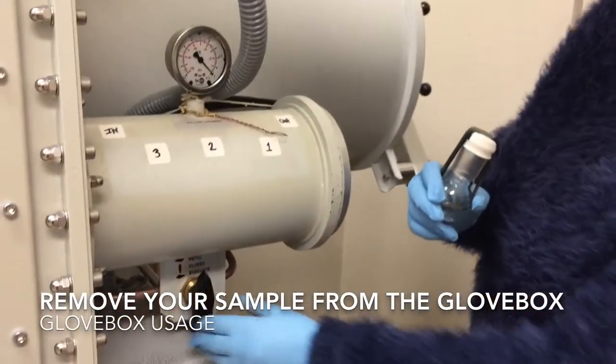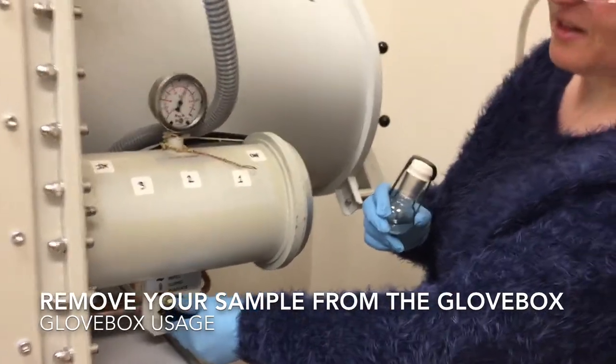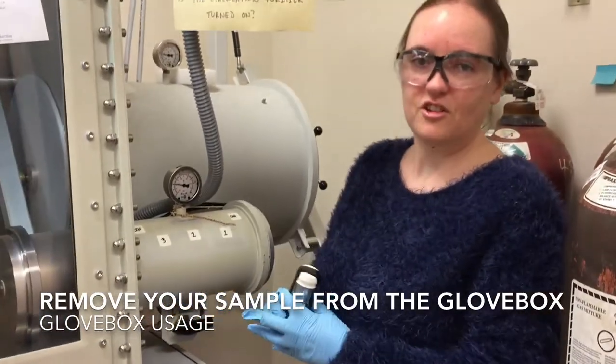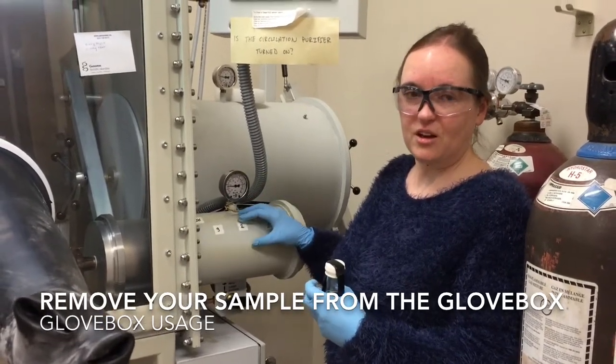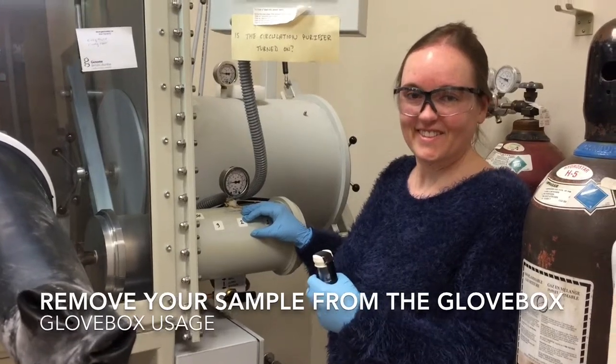Now that I'm finished, I can turn the valve back to evacuate, so that when I'm finished using the glove box for the day, the anti-chamber will be evacuated and ready for the next user.